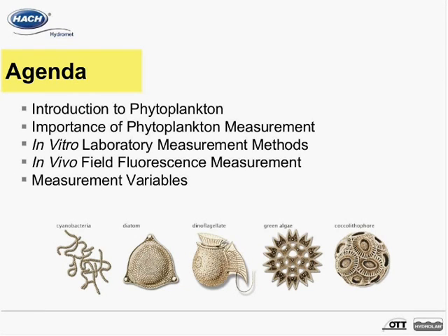Throughout our 30-minute webinar, I will give an introduction to phytoplankton, outline why phytoplankton measurements are important, review lab and field measurement methods, and provide an overview of the variables of in vivo fluorescence measurements.